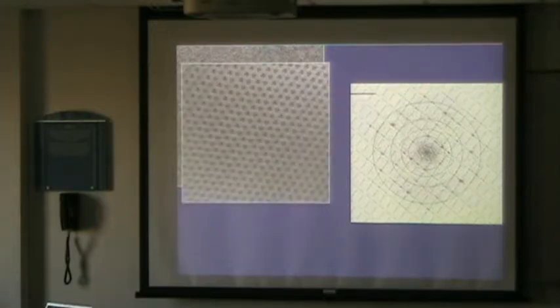And if I do a filter like this, then my crystal already looks quite a bit better. Okay. So I have not added anything in this case. I have actually only subtracted the noise from the image. And in a crystal, you can do this right away because the crystal, in a sense, does averaging for you in a way that it provides these spots. Because these spots, as I said, is technically a sort of an averaging procedure where, based on the reproducibility of your positions, the more you have, the better these spots are becoming.